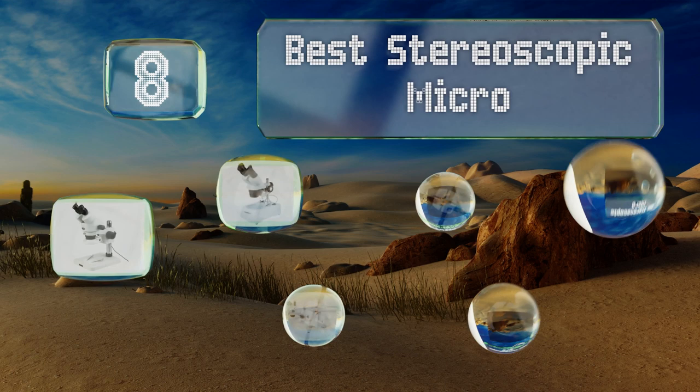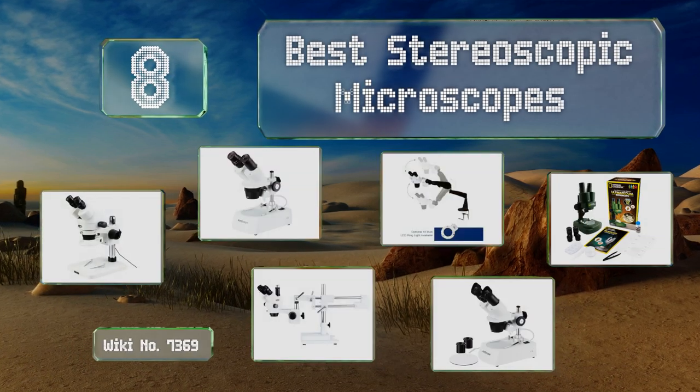EasyVid presents the eight best stereoscopic microscopes. Let's get started with the list.